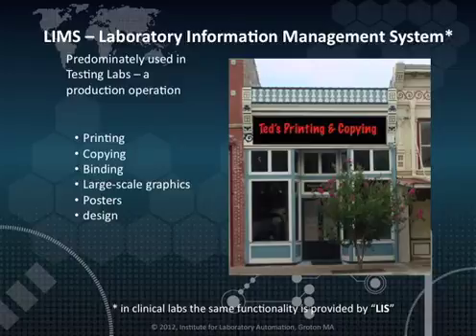That same problem exists in testing laboratories, where samples come in, need to be scheduled, work lists generated, reports issued, and being able to answer questions from people about when their work will get done. That is the task of a laboratory information management system. That's what it's designed to deal with.